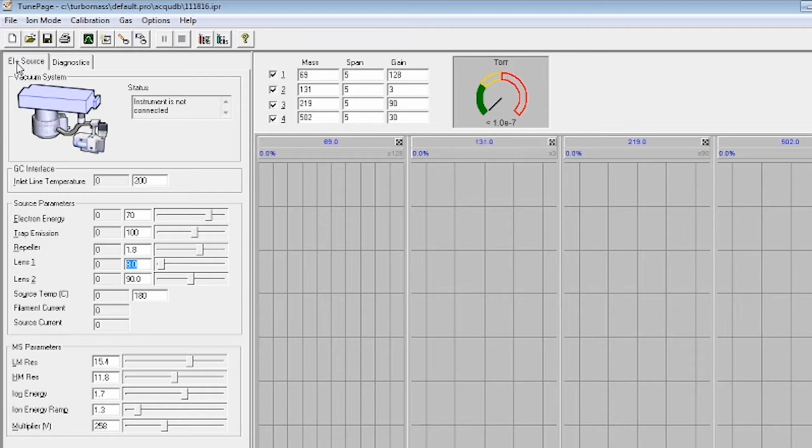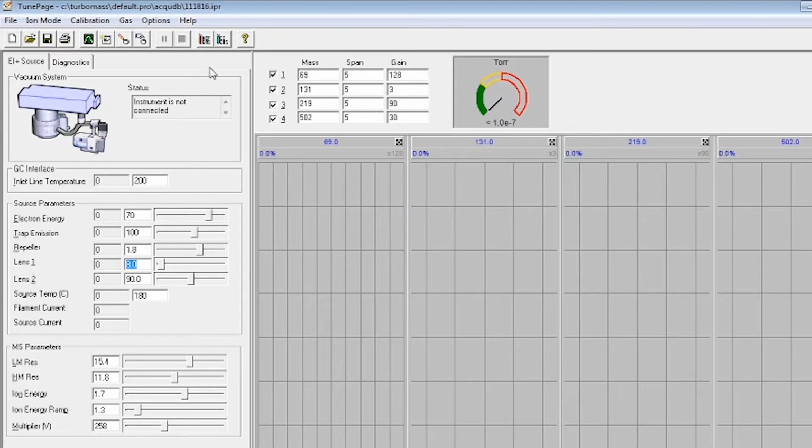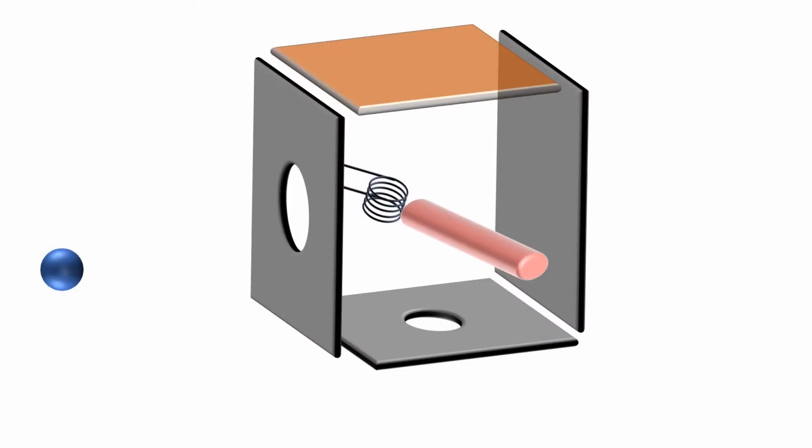Now I want to show you something else here. We saw that for LCMS with electrospray, you could get an APCI as an accessory, and it comes with it most of the time. Same thing with CI. This button is for CI gas, and you can see here there's options in the software. We can say, turn the CI gas on over here. So if you have the accessory, here we can say we're going to operate EI in positive mode, CI in positive mode, or CI in negative mode. So if you have the accessory, switching from EI to CI is pretty easy in GCMS.